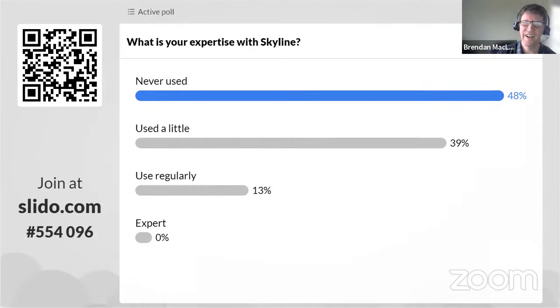Although certainly even the fact that we have 50% that have done something with Skyline is much different from when we started doing these things. It would be more like, maybe 25%, a quarter, would have any knowledge of Skyline at all, even know that it existed. Okay, so we've got about maybe 65 people active. Let's go to the next one, and that's pretty typical.